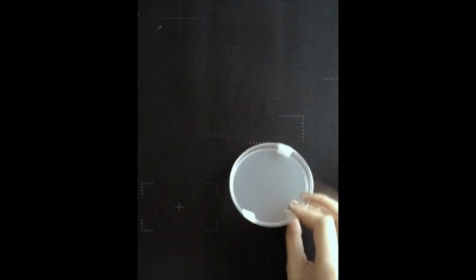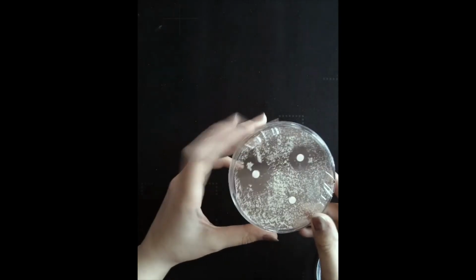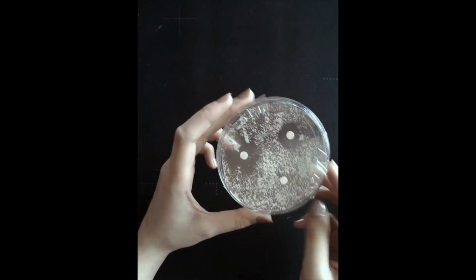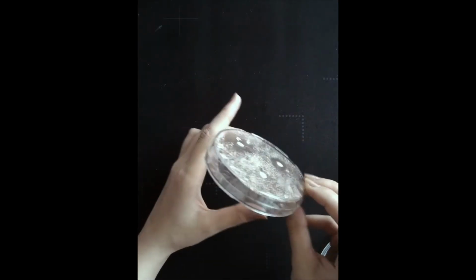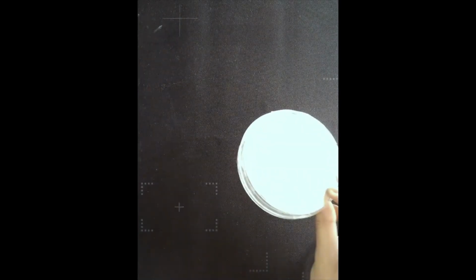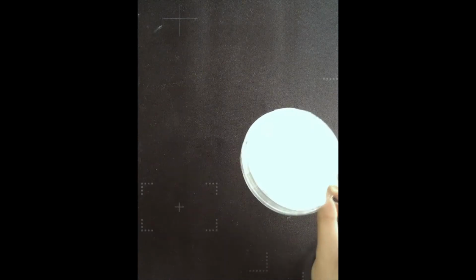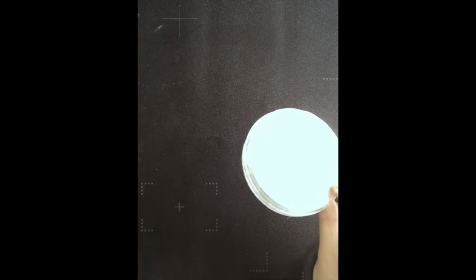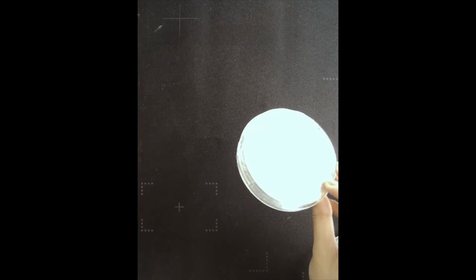If I just show you another Petri dish. As you can see on this Petri dish, all this bit here, those are visible colonies of bacteria. So this Petri dish has been left for a few days and the bacteria have grown. Now in schools, this Petri dish will be left at around 25 degrees. You don't want to keep it any higher than that simply because you don't want harmful pathogens to grow. Whereas in industry, where you want bacteria to grow very fast so that you can utilize it, the Petri dish will be kept at a higher temperature.